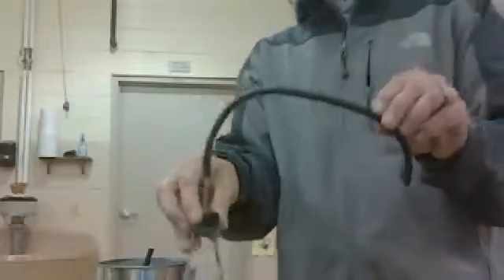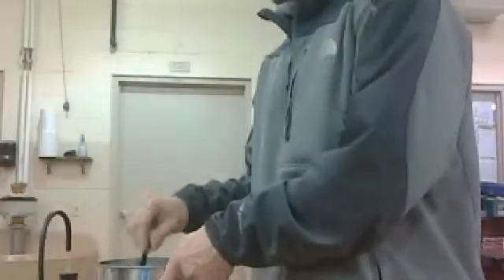The third part that I want you to get set up is here. Instead of using balloons, we're going to be using what are called Erlenmeyer flasks. This is an Erlenmeyer flask. You'll also have a bucket of water. Trust me, there's water inside here.